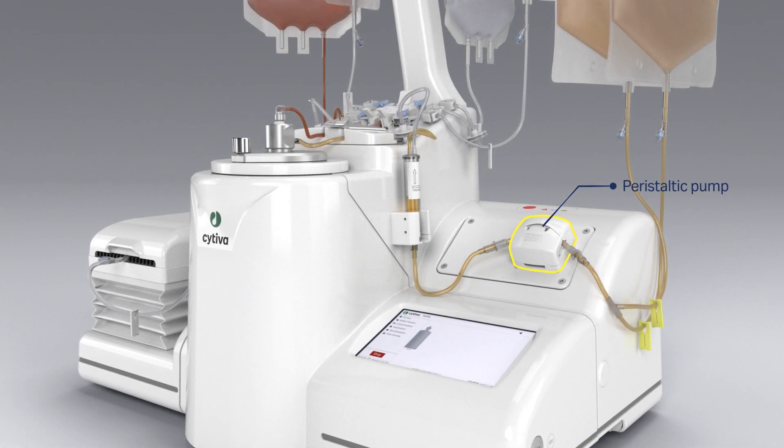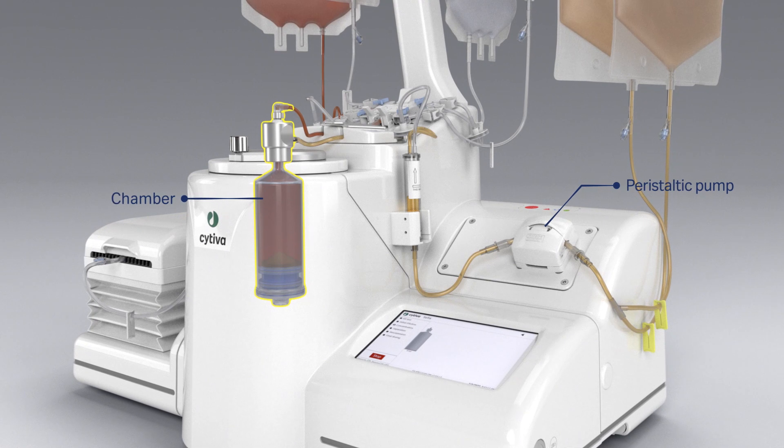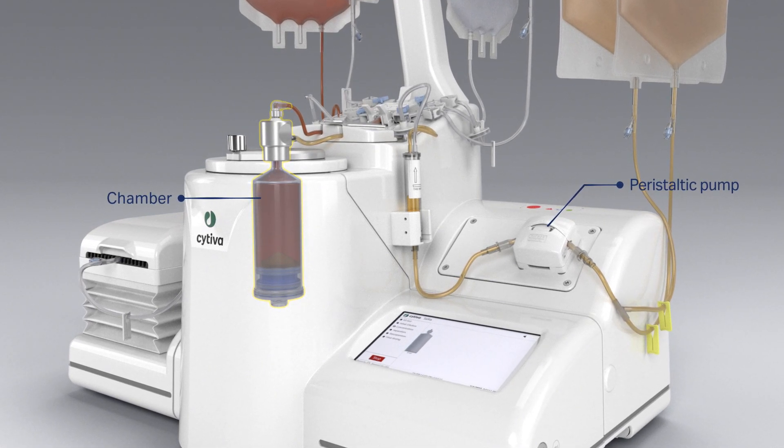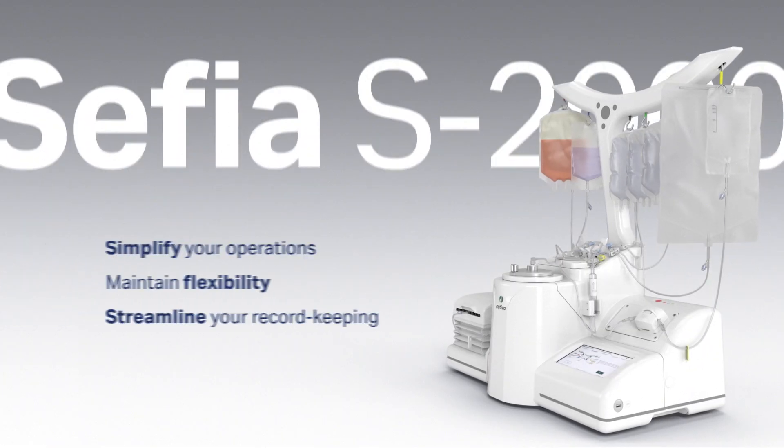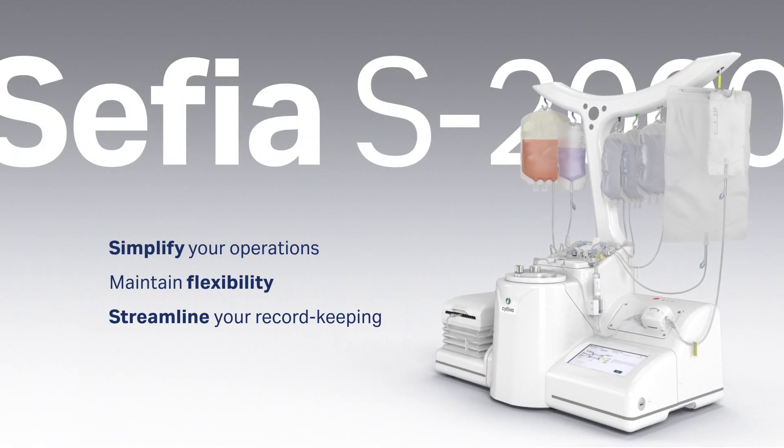For large initial volumes, the peristaltic pump is used in combination with a specific separation chamber on the single-use kit to perform continuous flow. The peristaltic pump extracts the supernatant while the initial product fills into the separation chamber.